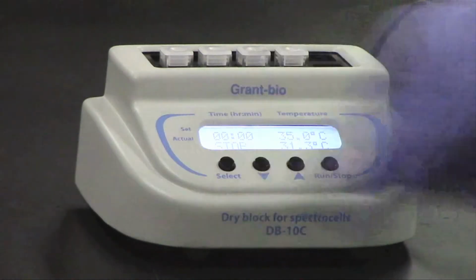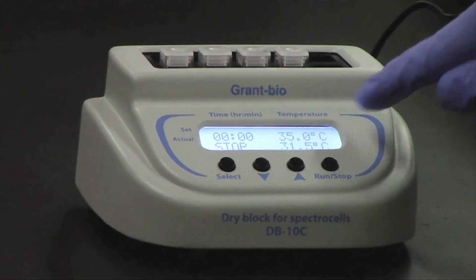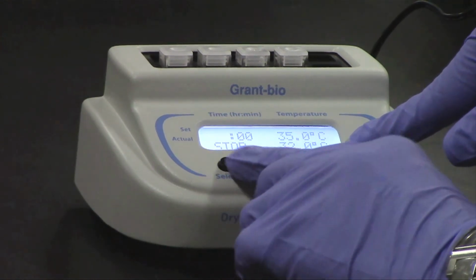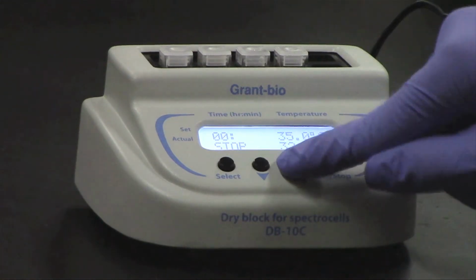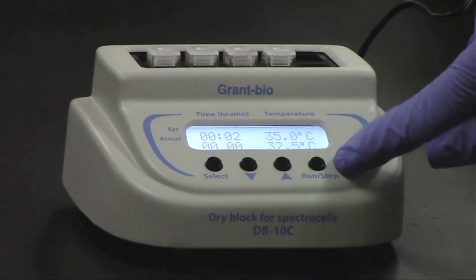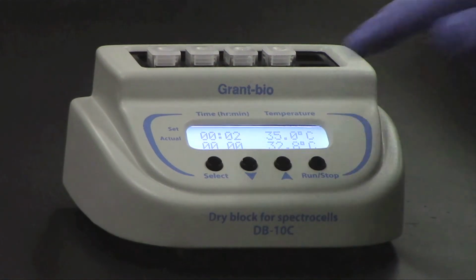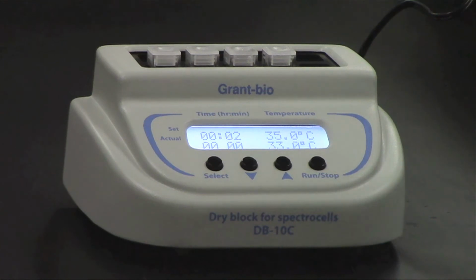Additionally, there's a timer that you can set, and once you've reached the actual temperature, you can go to Select, keep hitting Select until you get back to the timer. The second part is minutes, so say you want 2 minutes, and then you can click Run/Stop, and the timer down there shows the actual time that's accumulated or elapsed. And at this moment, it's 0 because there have been 0 minutes that have elapsed.